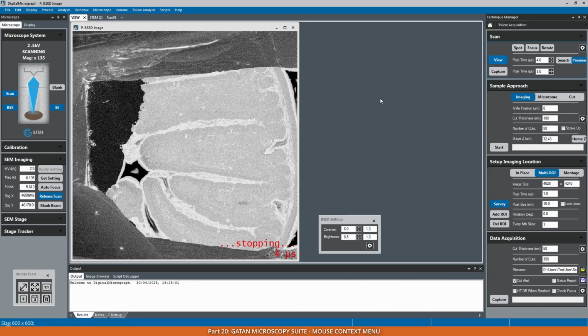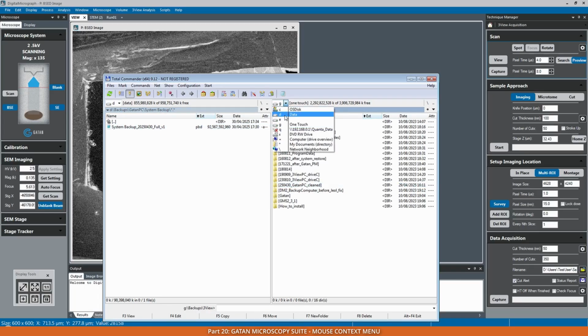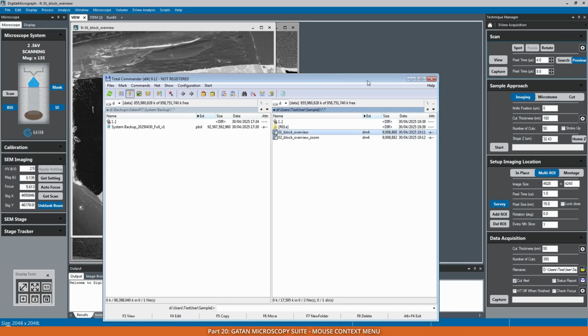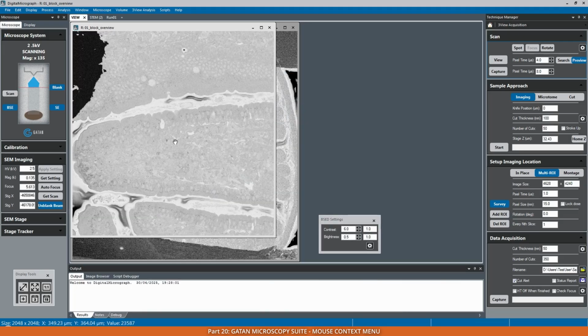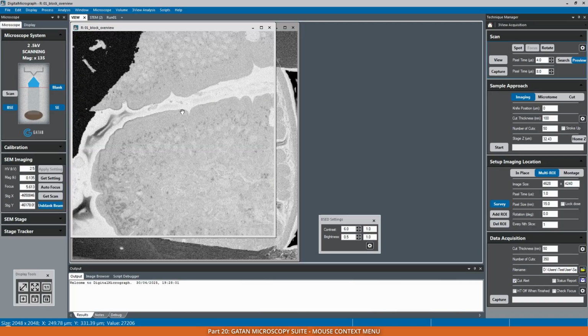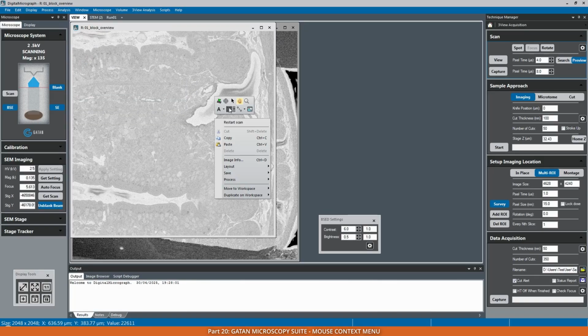So actually, let's stop the view. Let's get back to our folder. So we have these snapshots. I can put them here. And then if I have this hand, I can use the scroll wheel to zoom, and then I can pan around by pressing the left mouse button. This was something useful, but I don't remember what that was. And then I can put annotations and the boxes.